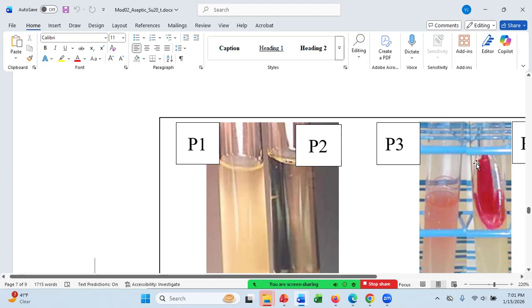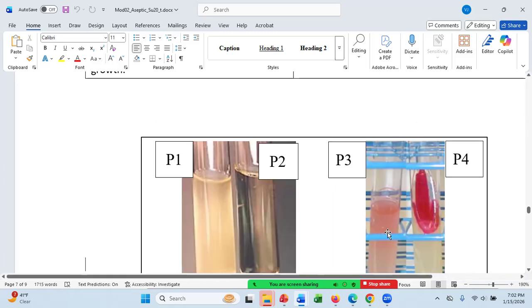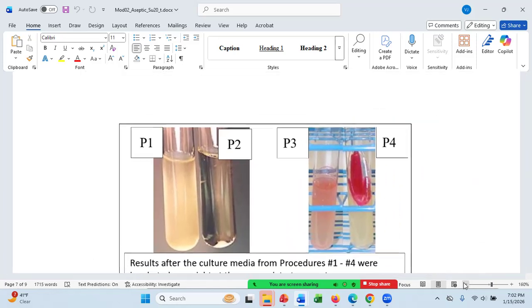And as you see, there's red everywhere. That's not a white colony. That's actually the light being reflected back. So there's no non-red colonies here. Of course, it's growing confluent. You can't see any colonies. But the point is you can determine even if there's a minor contaminant on a slant. And in a broth, you wouldn't be able to determine that. Here you can see the broth in a liquid culture looks pinkish in color. On the slant, it looks reddish in color.